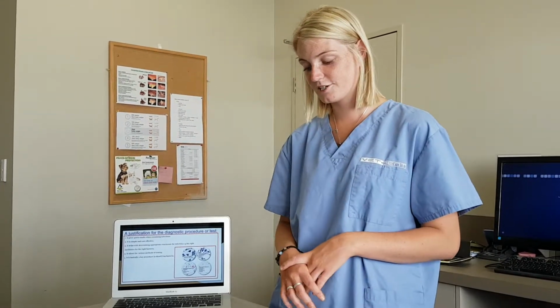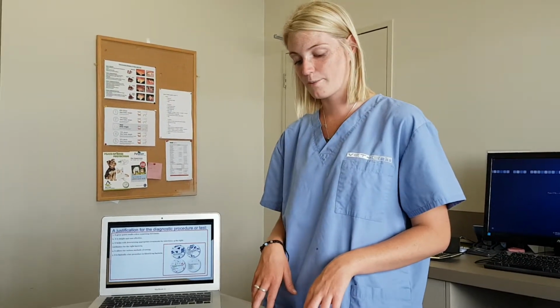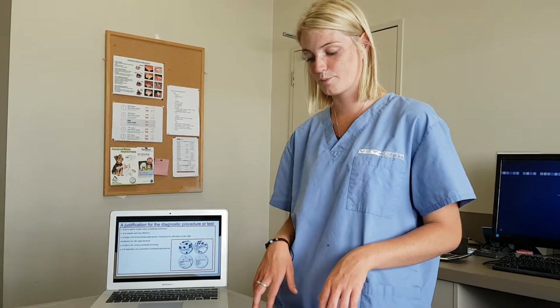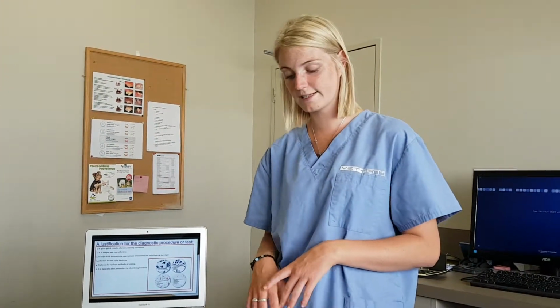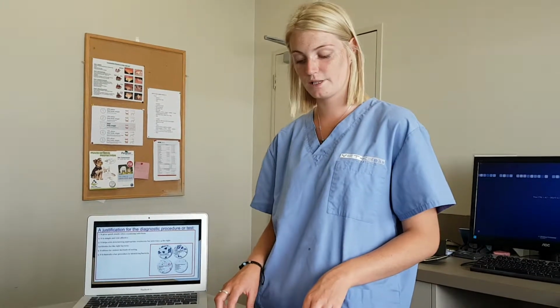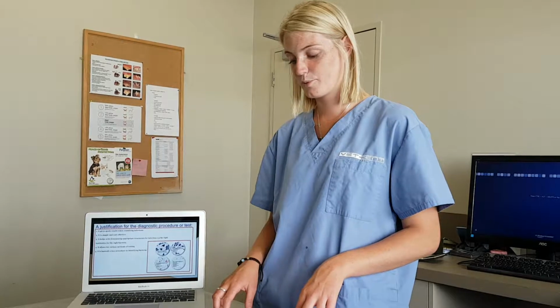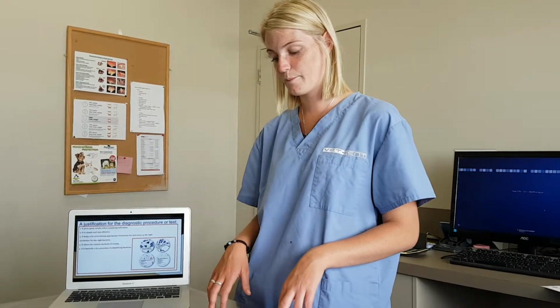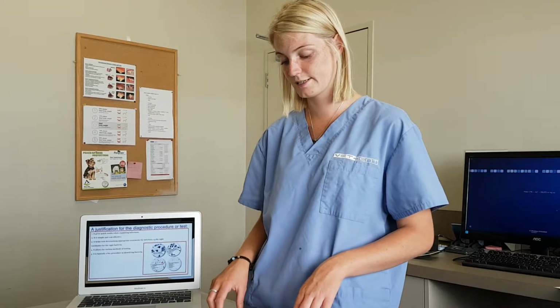The procedure is performed to produce information regarding the type of organisms that are directly present from the growth on culture plates. Unlike some other alternatives, it is cost effective in identifying the presence of microorganisms in normally sterile body fluids.